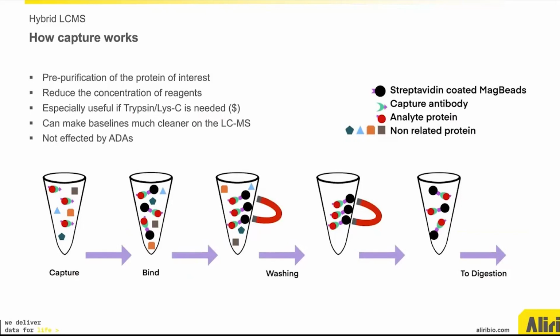Another advantage of this is that it allows you to reduce the number of reagents used during the digestion step, which can help keep up your HPLC and mass spec so that you can process more samples between primary maintenance time periods. You can also use off-the-shelf generic antibodies such as protein A or G or anti-human FC or anti-human IgG or any other generic antibody that may not be as specific as you need for an LBA analysis, but is commonly available and readily available.